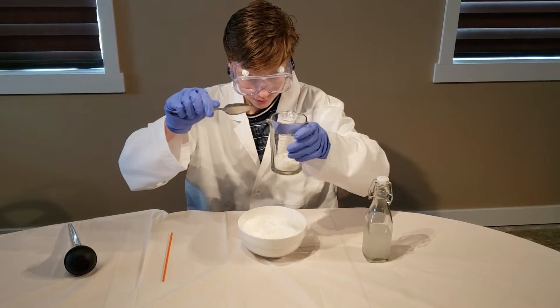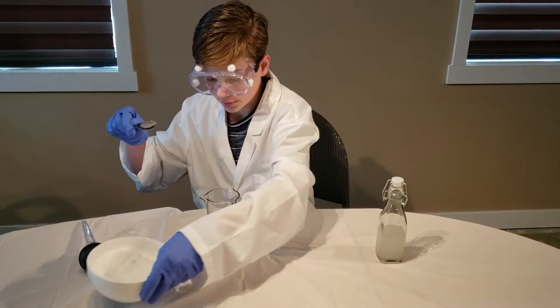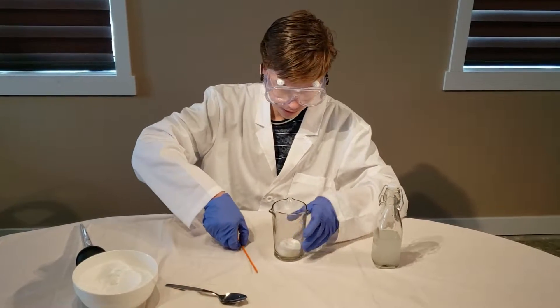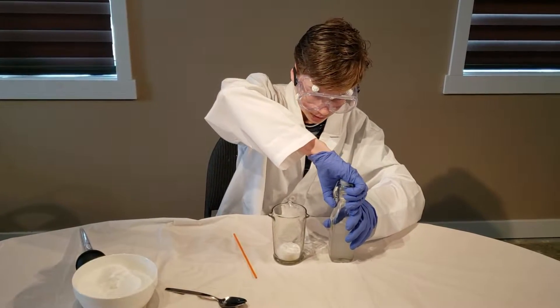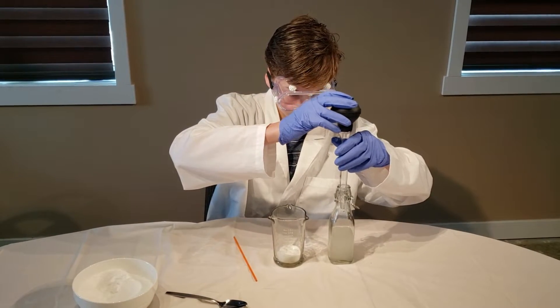In the background or to the side, you can see I have a turkey baster. Don't worry about it, it is completely useless. Do not feel like you have to buy one. Also, make sure your mixing spoon is plastic or else it will be dissolved if it is metal.